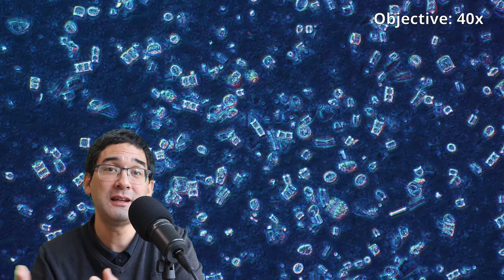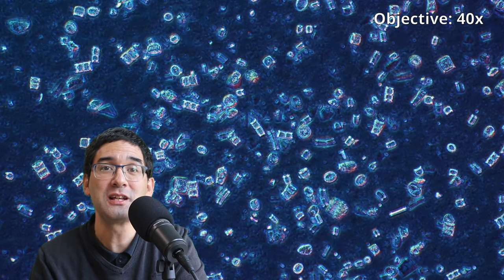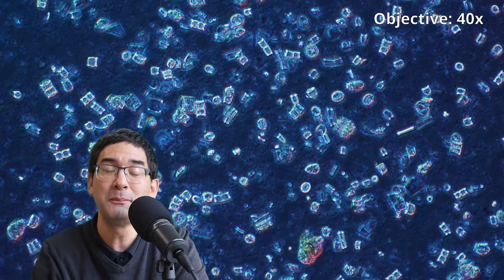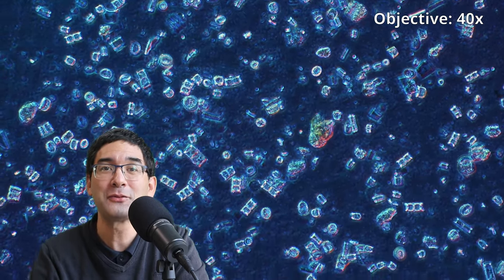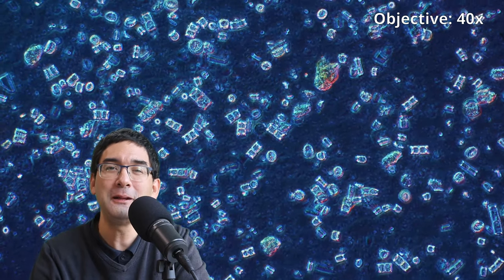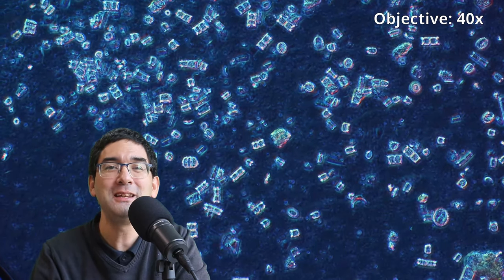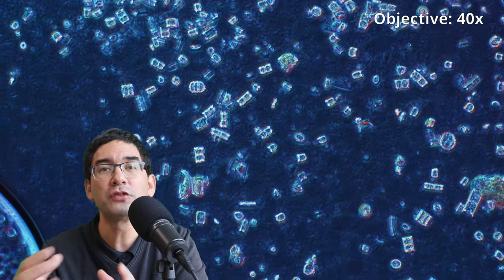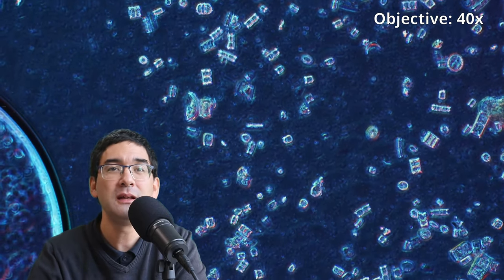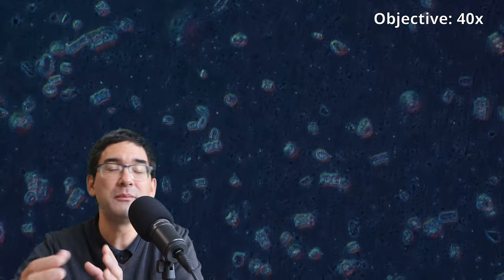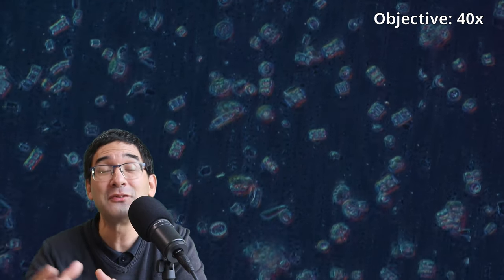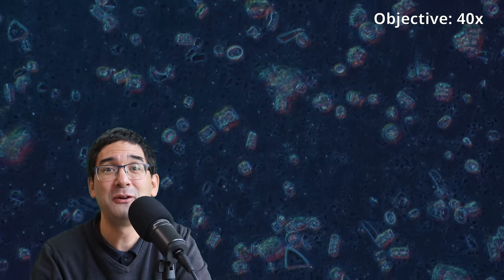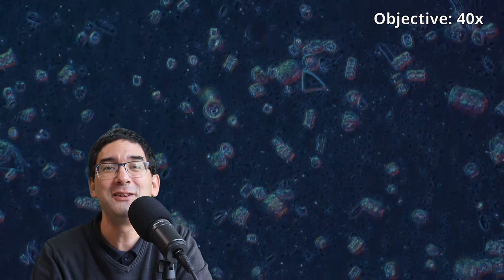I would like to now encourage you yourself to go out to collect diatoms, go out on the pond, scratch some material off from a rock, put it under the microscope. And I tell you, probably they look a little bit more interesting, even because you can see a large variety of different diatoms. Some of them are arranged in packets, some of them are single, and many of them are also able to move around and glide around on the surface of your microscope slide. Plenty of things to observe.